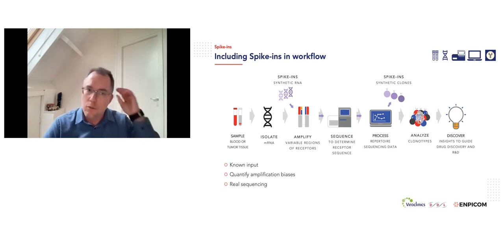All right, so in order to validate our setup a little bit more, we decided to use some synthetic clones to really track what's going on in the amplification and in the sequencing. In the past, people have used these sort of benchmarks and have used cell lines to do this. There are several publications out about this. But we opted for using synthetic RNA, and this would basically generate synthetic clones.